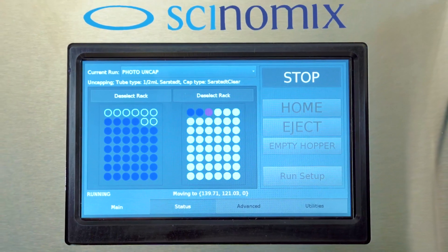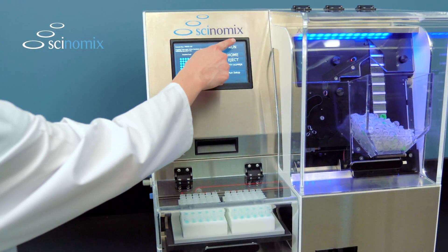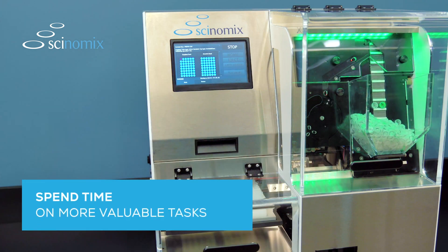The intuitive touchscreen design makes operation fast and hassle-free. With just a few quick touches to start, users can walk away to spend time on more valuable tasks.